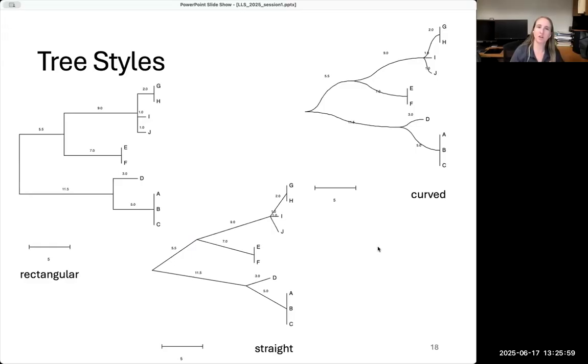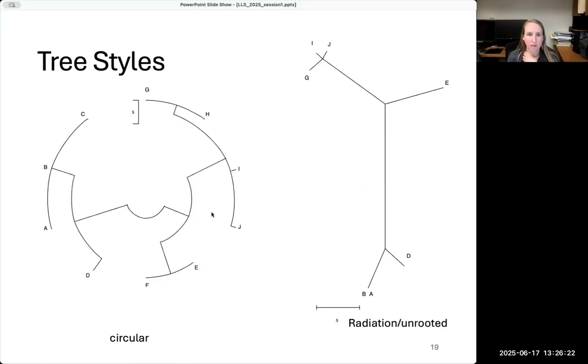And then one more thing I wanted to show y'all while we're still talking about trees is that sometimes you'll see really different trees. They all mean the same thing usually, but they're just set up differently. This rectangular style one is like the one we just looked at. Sometimes they may be more branch looking lines. Sometimes they could be curvy like this. And then more often I see these circular ones. They usually take up less space, so that's one of the benefits people use them.